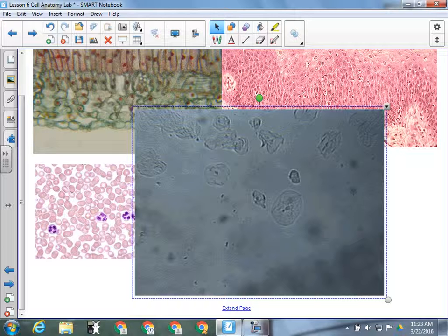Things like hepatitis, HIV, things like that. We're not allowed to take any chances. It's not that I think any of you would have any of those horrible diseases, but I'm not allowed to have any of those kinds of bodily fluids in the lab. That's why I'm letting you look at the preserved blood slide. It's not your blood, it's safe blood, and we don't have to worry about it. So just please be mindful of that.